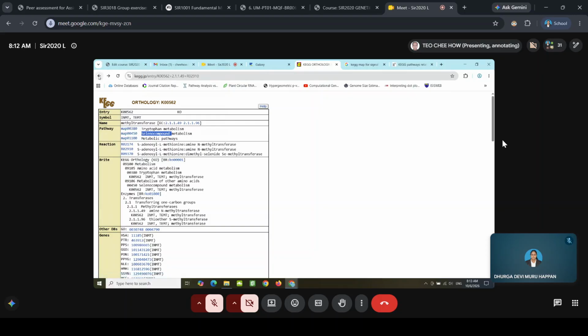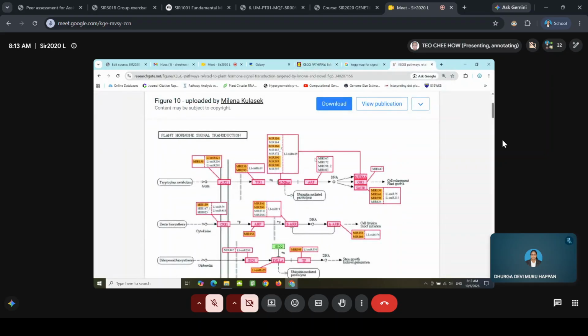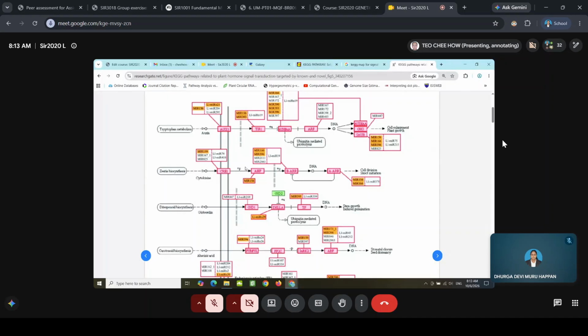So those are more focused, more defined. So for example, this one is only this pathway, and you see that these genes are involved maybe in here, right? So by using, I think, one of the R programs, you can actually plot this kind of pattern, and then you can manually put in your other information here. You can either put it in like this, or you can even draw it yourself.